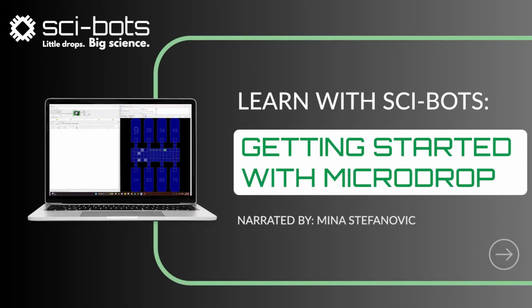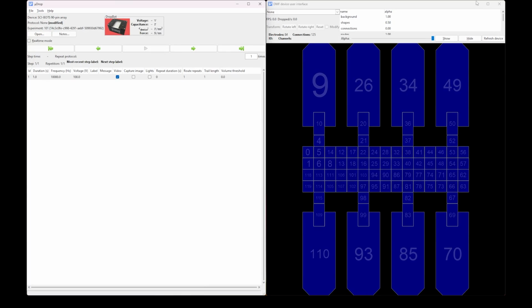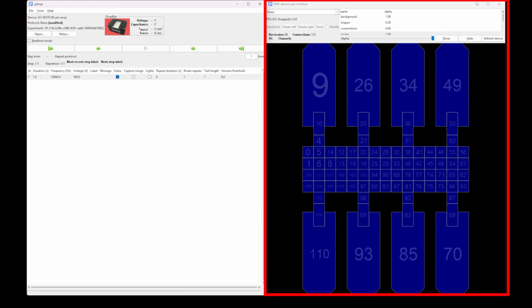This DropBot tutorial will guide you through the basic functions of the Microdrop software to help you get started on controlling your DropBot. Begin by loading the Microdrop software. You should have two windows that pop up, the main window featuring the protocol builder on the left and the DMF device view on the right.